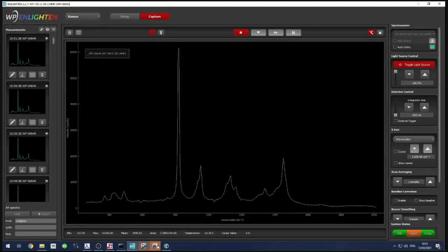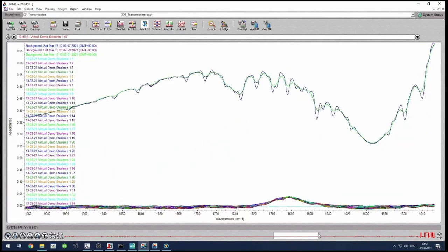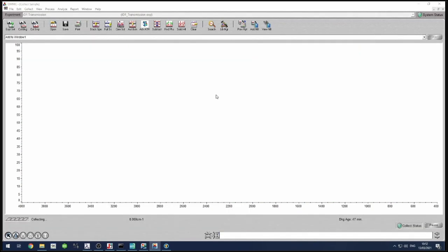This is a spectrum, and this is the basis of spectroscopy. Similarly, when we look at the FTIR, we can see a lot of spectra taken over time. So here they are all overlaid. So this might be more familiar to you. We can process these spectra to see exactly the regions of interest, how they're changing over time. But again, it is impossible to interpret this kind of data with the naked eye. These are the signals directly from the sensor.